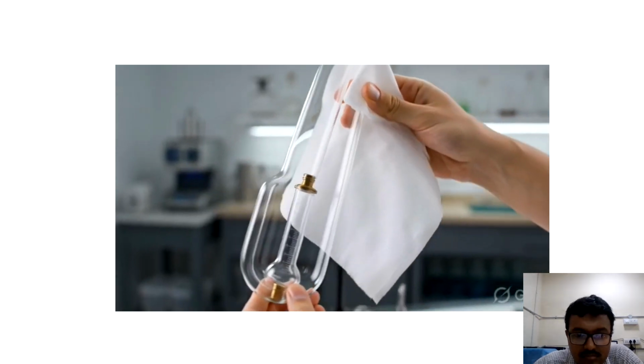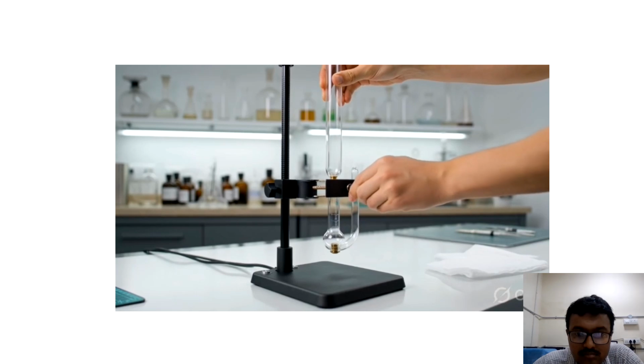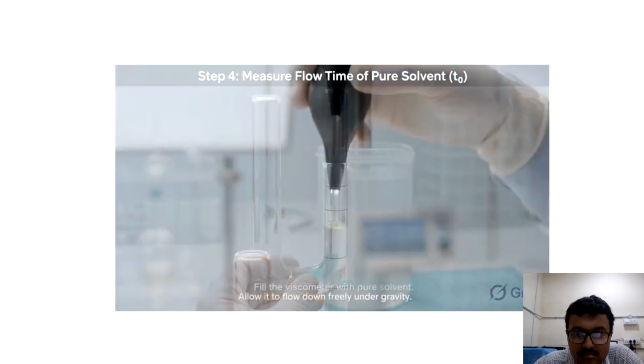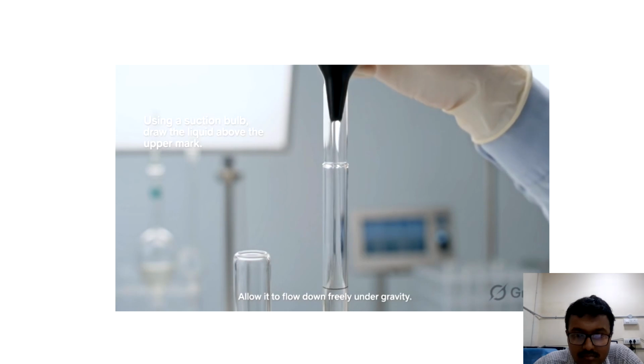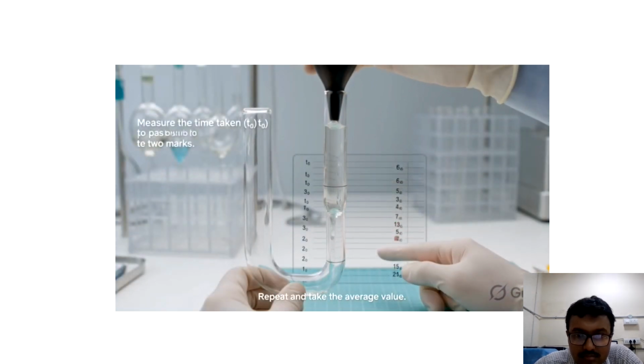Take a clean and dry Ostwald viscometer. Fix it vertically in the stand. Fill the viscometer with pure solvent. Using a suction bulb, draw the liquid above the upper mark. Allow it to flow down freely under gravity. Measure the time taken to pass between the two marks.